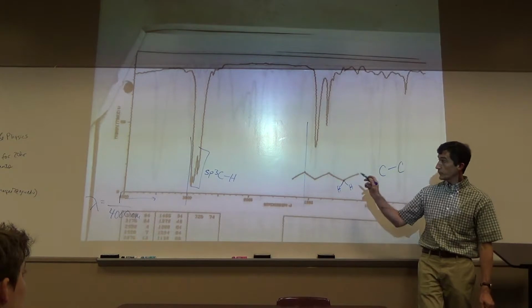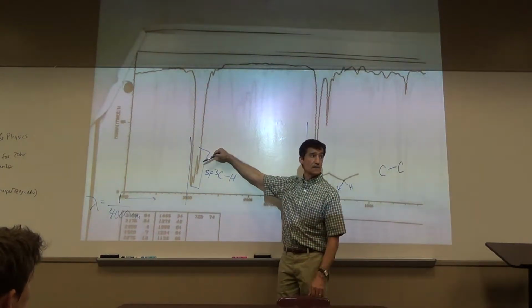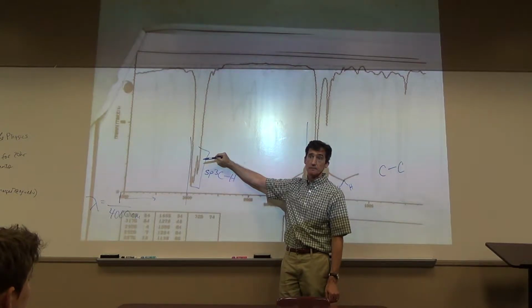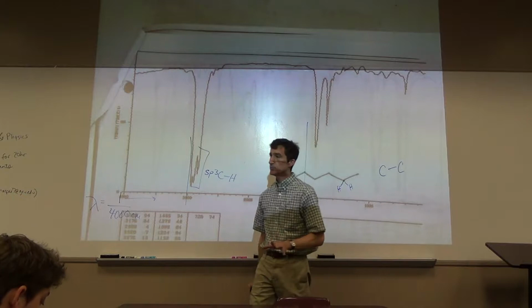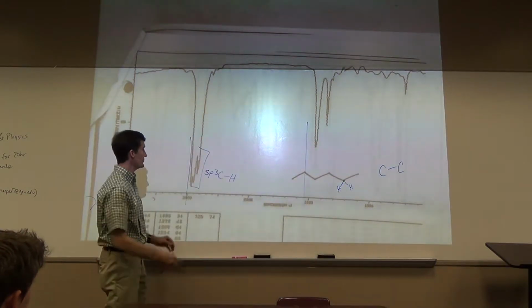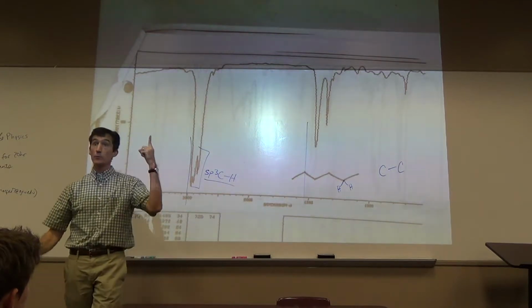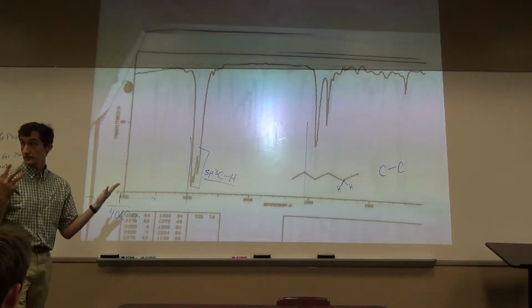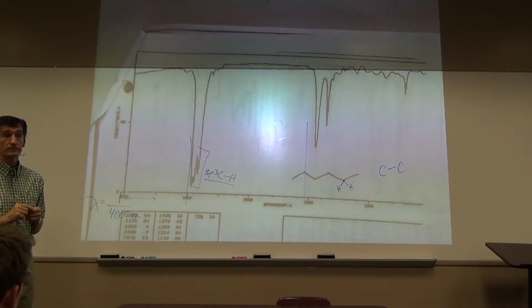So all 14 H's. What you cannot do is say, okay, I expect 14 peaks. You can't do that. We can do that with N-H's and O-H's, but not with C-H's. All we can say is we have some peaks in this region. That means there's that in the compound. It may only be 1, or it may be tons. You can't quantify with your C-H's.